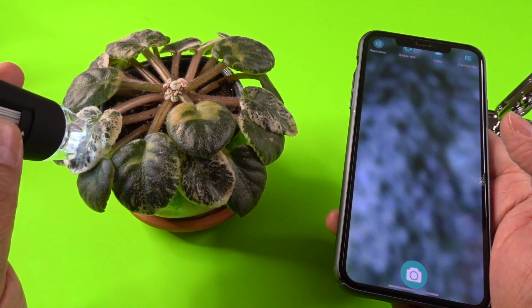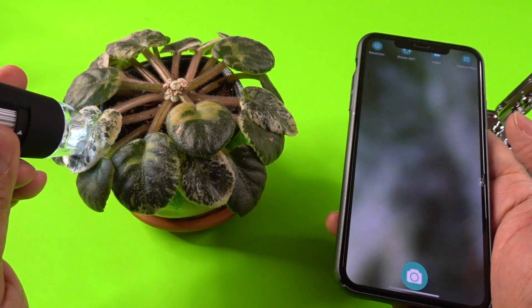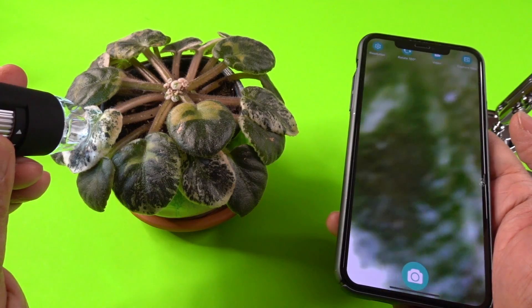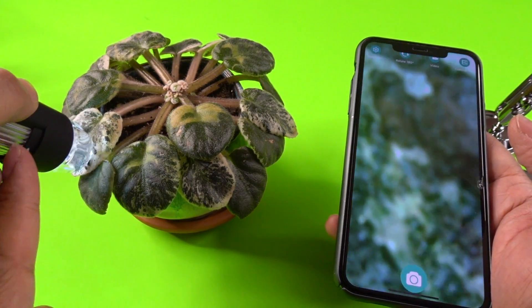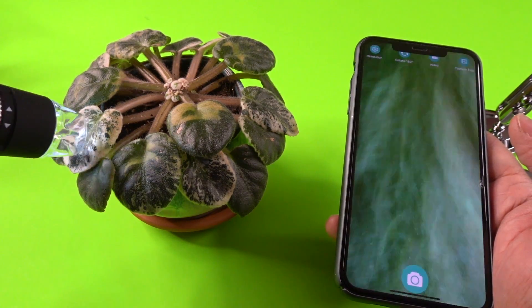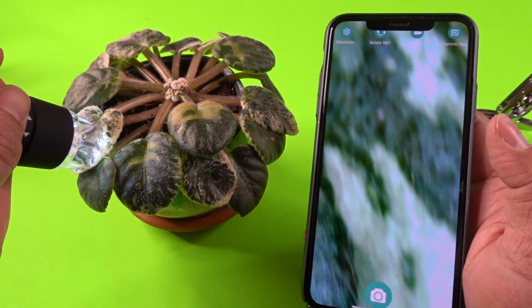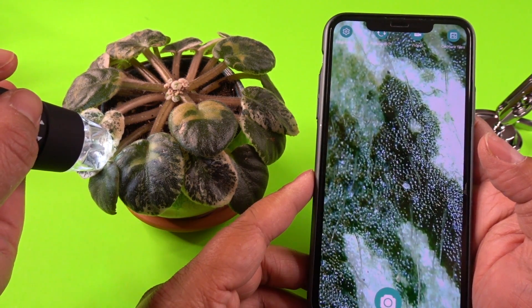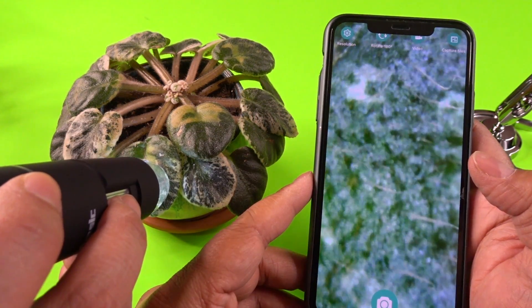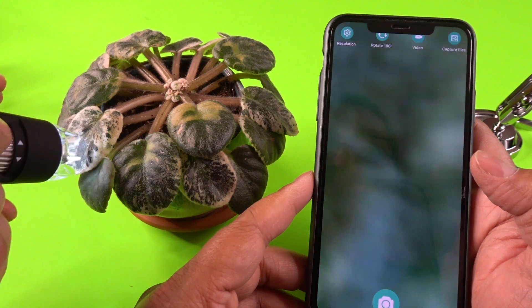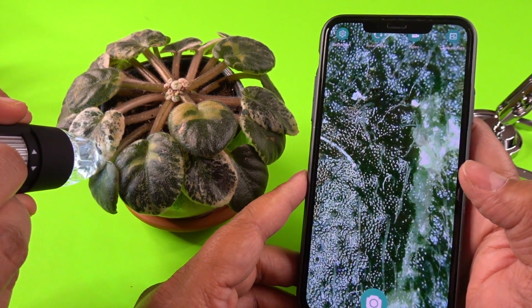So let's change the focus knob right here. And find a way to focus it. Oh here we go. It's getting more. Oh look at that. Let me ask my assistant here to play with the focus. Wow look at that detail of the leaf that we're looking at. Wow look at that detail right there.